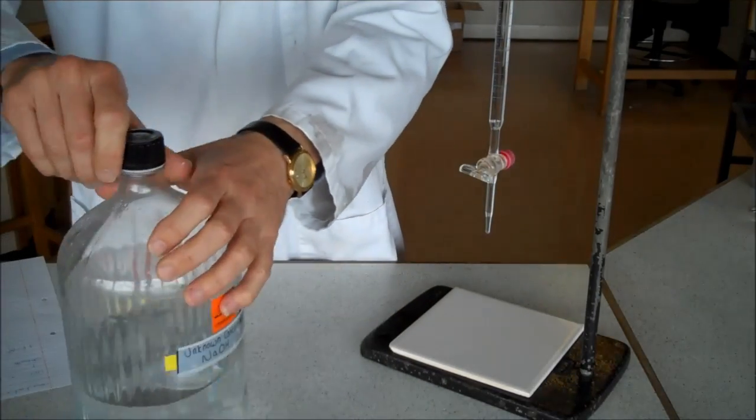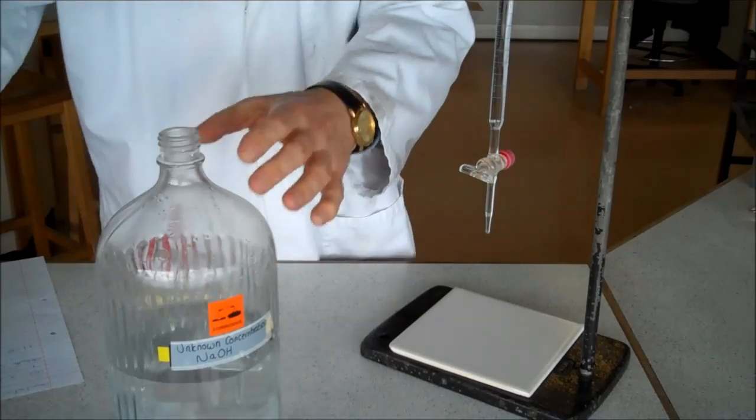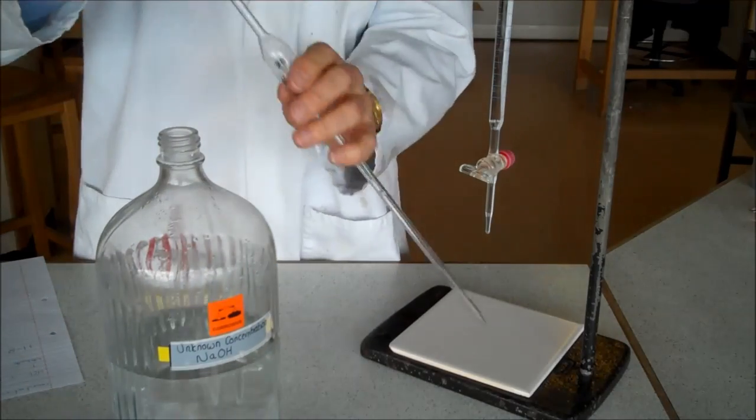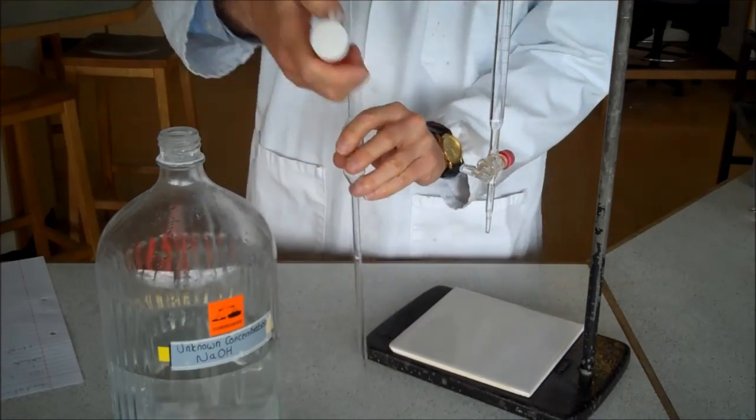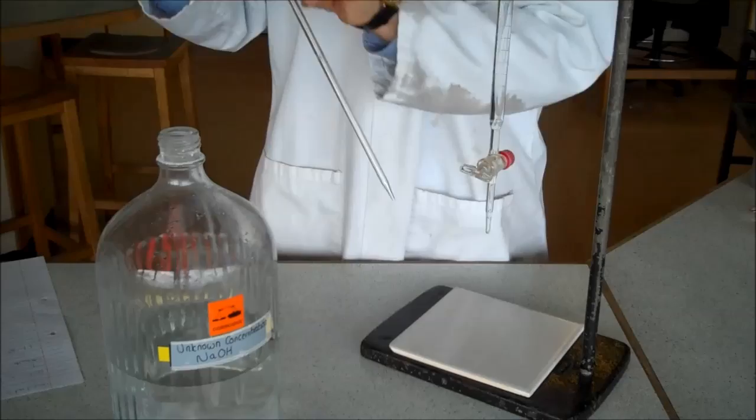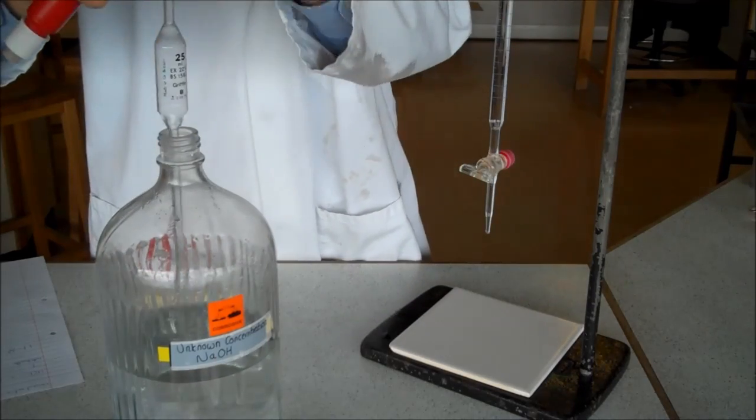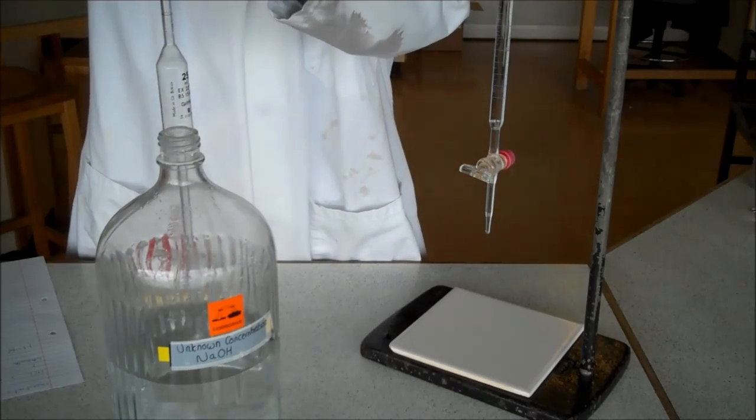First step is to measure out an accurate volume of that. For that we need a volumetric pipette, one of these devices, and a sucker, or a pipette filler, that will suck up the liquid into the pipette.